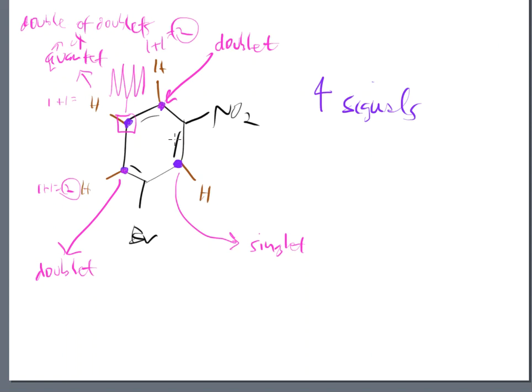So in my head, I know that the structure of that molecule at that position will have a CH on one side and a CH on the other, and they are chemically different from each other, meaning there's something else in the molecule that's making it different.